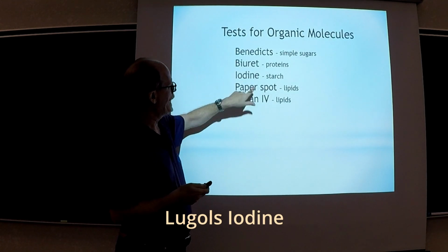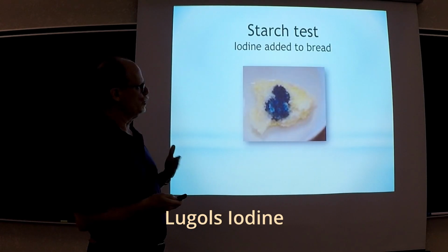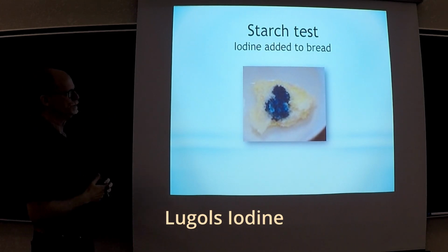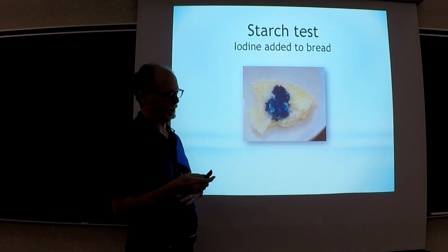Right, but I just put iodine here. The other word that you could see, like maybe on the handout or something, is Lugol's iodine. Lugol, L-U-G-O-L. So you might see that word used, but iodine will always be associated with it.